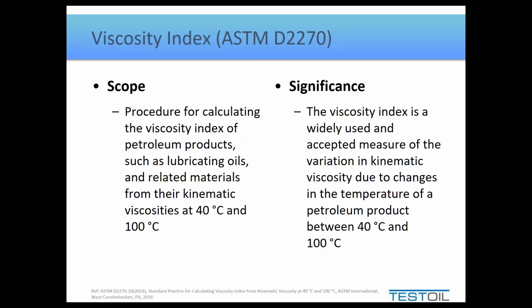The significance of this is it helps confirm if you got mixtures of fluids and or shearing. So if you're trying to select a new oil, you may also look at a viscosity index. It's just a way of evaluating how stable its viscosity is with temperature.